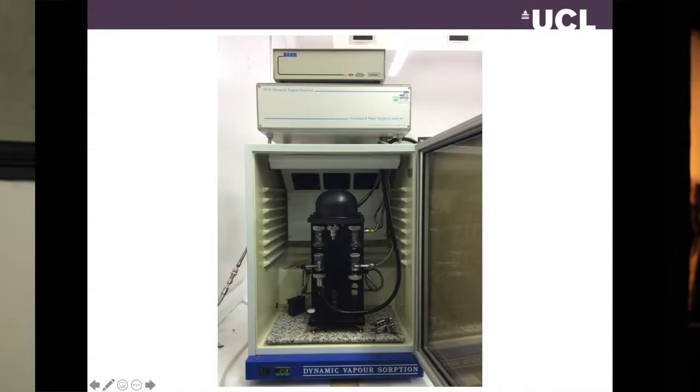Many years ago we actually had a go at building our own combined DVS-NIR instrument. It was built by one of the postdocs in the school about 20 years ago and it's still going strong. It is used by students quite frequently because it's important to get extra information out of your sample if you can.